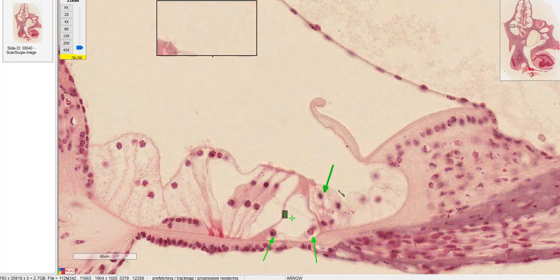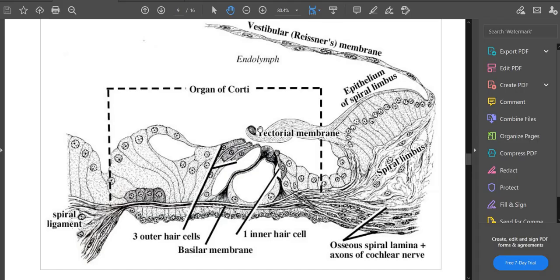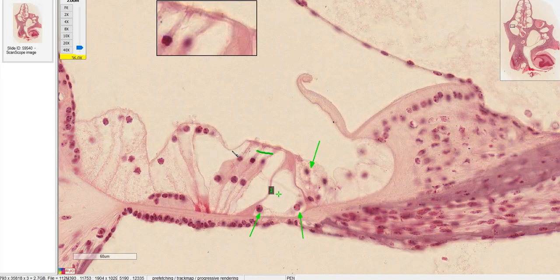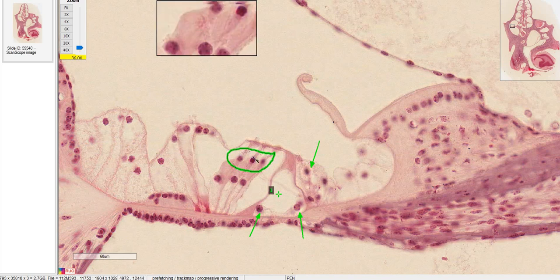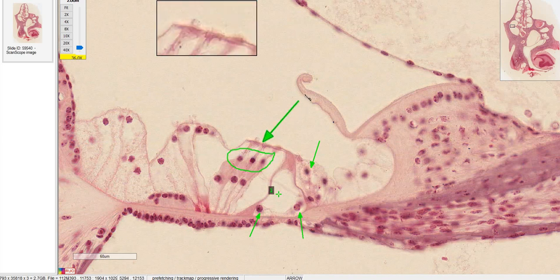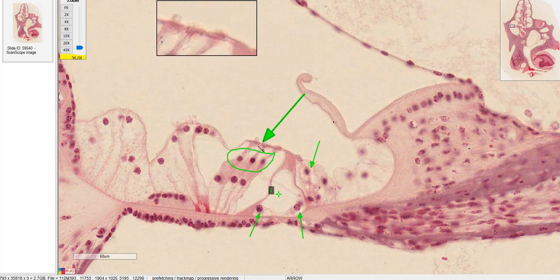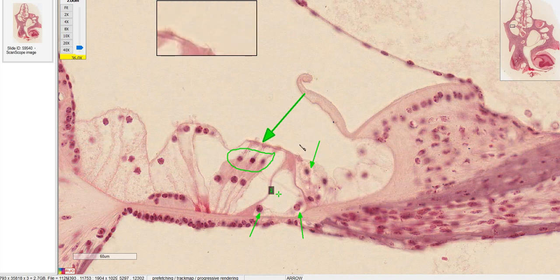Here's the inner hair cell on the actual slide. Now let's talk about the three outer hair cells — their job is to amplify the signal coming from the inner hair cell, and their axon projections travel along with the rest. On the slide, these are the three outer hair cells' nuclei plus three supporting cells for them. Normally the tectorial membrane is attached to the stereocilia of the outer hair cells, but the inner hair cell is not attached — it's actually free in the endolymph.